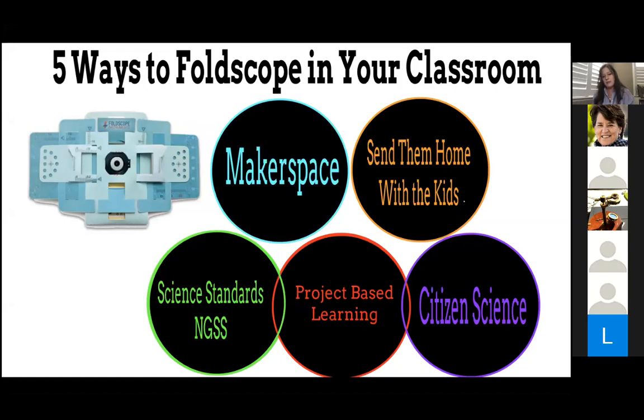And what I would do in my presentations when I presented to teachers is that I had gotten a special agricultural grant to buy Foldscopes. I would give a teacher who came to my session a Foldscope, tell them about the Asian citrus psyllid to educate teachers who would hopefully use that lesson as well, and then give them a set of the slide library. I have maybe 5 or 6 sets left, so if you're interested in teaching that, you could message me and I could get you a set of those slides.